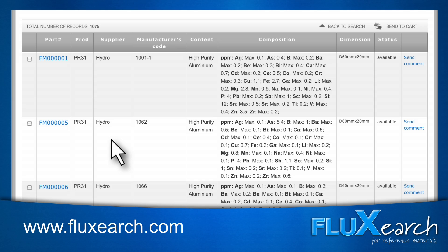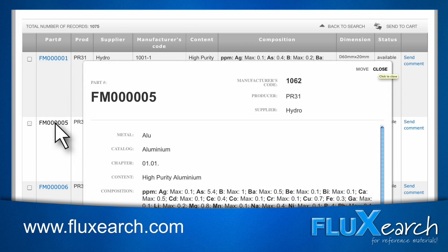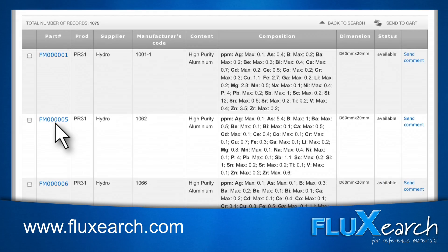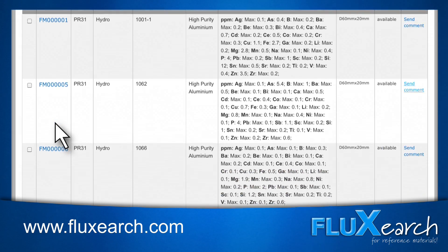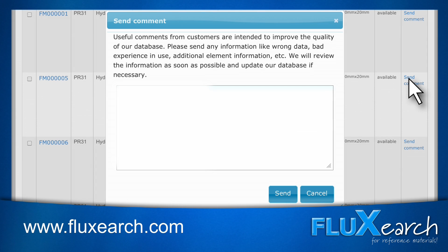If your search was successful, a list of standard materials will appear. To see all information regarding a CRM, click on the blue part number. The quality of the database strongly depends on how up-to-date the data is, therefore it is very important for us to receive information on possible errors or other important information. By clicking Send Comment, you can send a comment to the database manager.